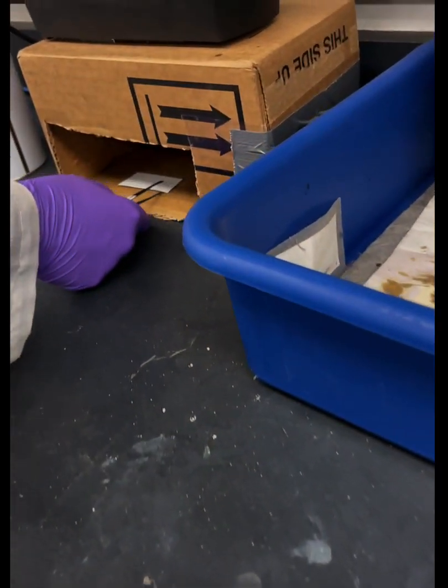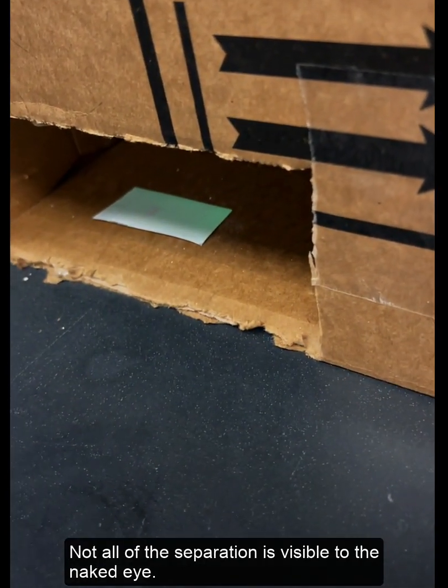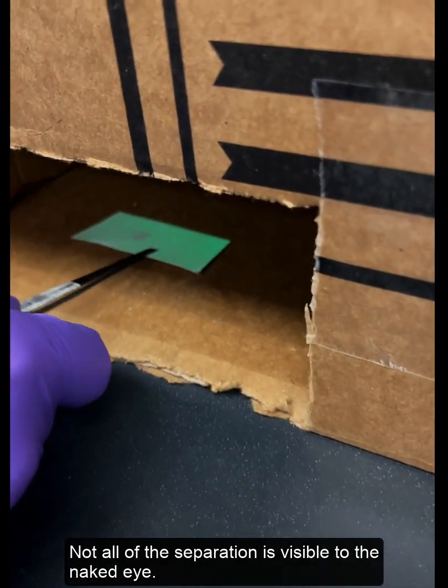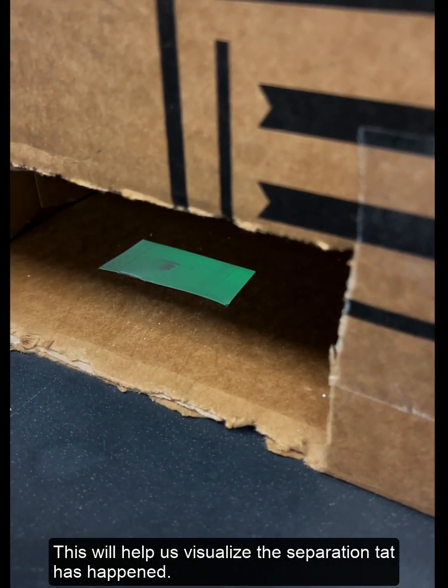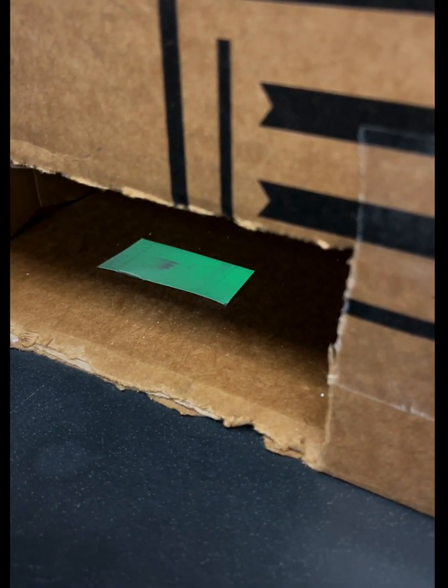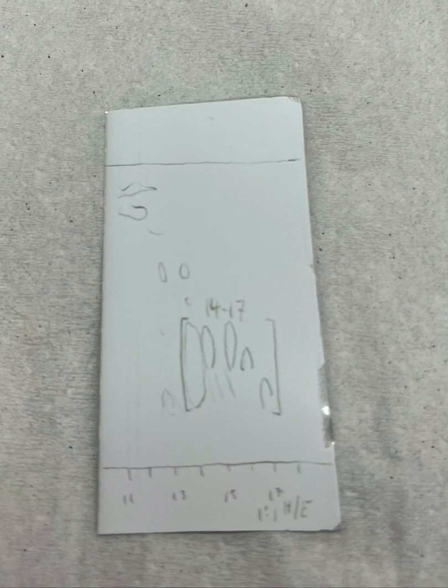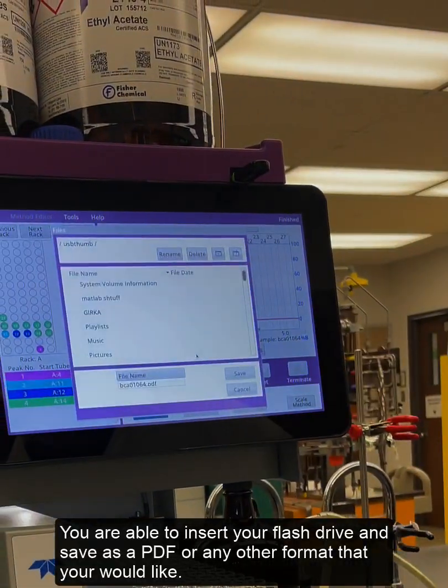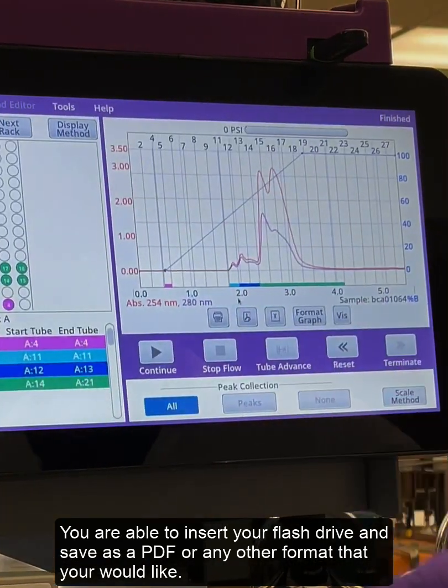We will be testing the TLC strip under UV light because not all of it is visible to the naked eye, and this will just help us visualize the separation that has happened. A marked visual of the separation that has happened. You are able to insert your flash drive and save it as a PDF or any other format that you would like.